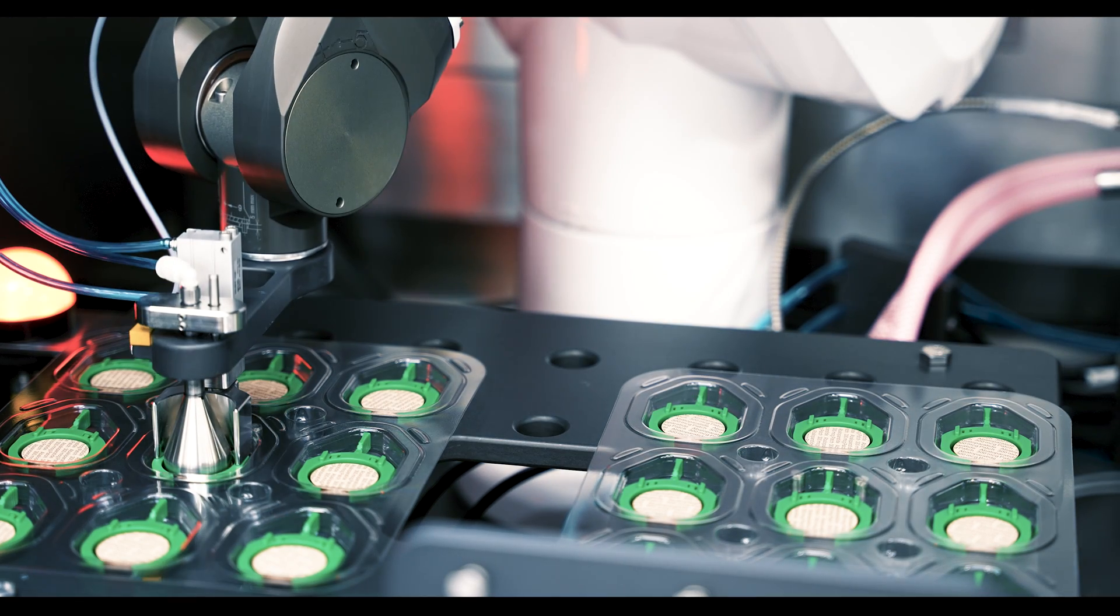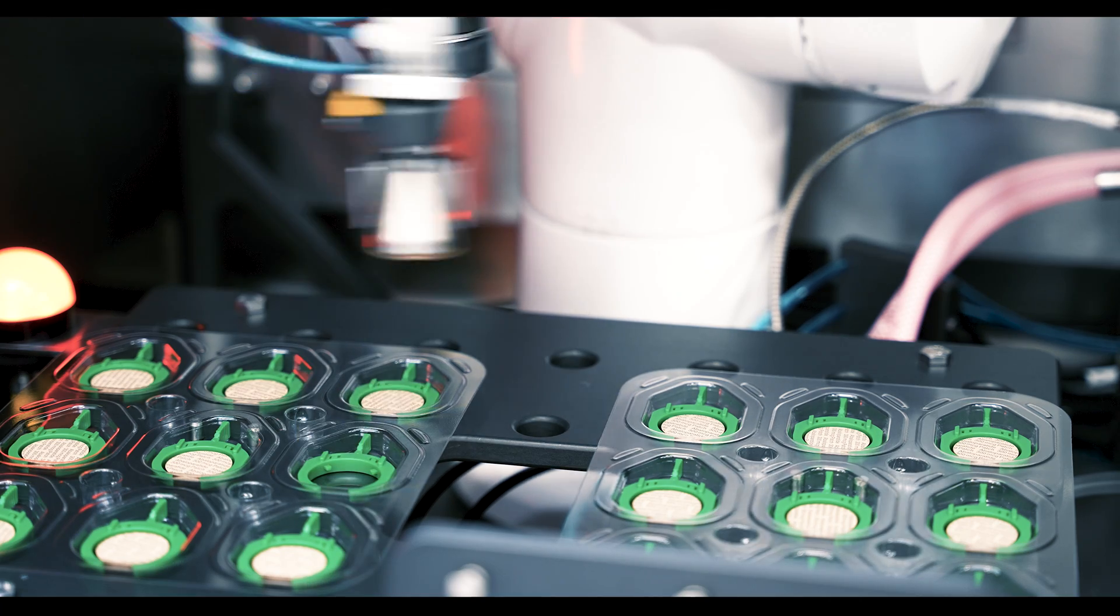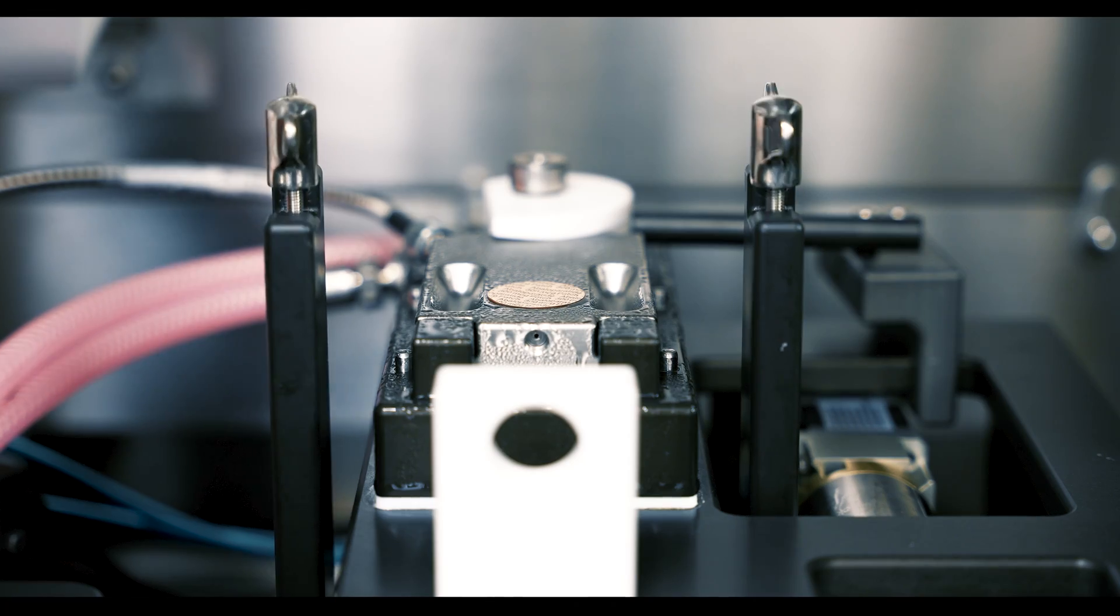Repeatability and accuracy was important to us, and then longevity in this environment. Pretty simple from a robot standpoint, but just being in this environment had to stand up to that aseptic world.